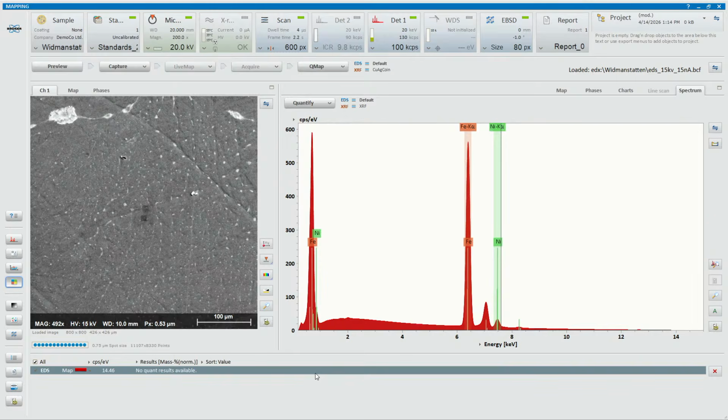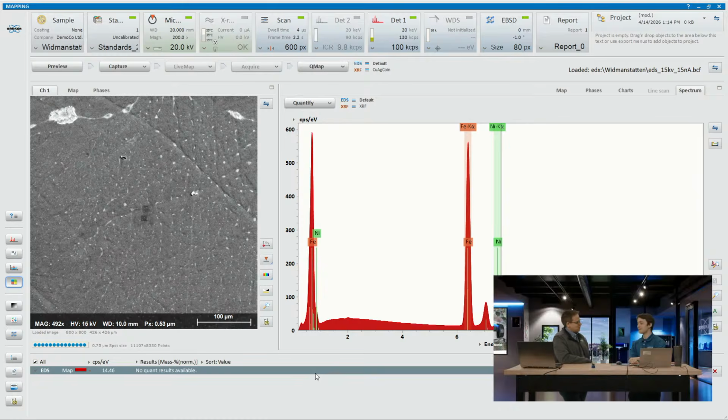It looks about the same everywhere. Yep. Yeah, I mean, stay tuned. A future episode, we'll dive more into EDS and look at more interesting samples. But in this case, very homogeneous. And we can see right there.